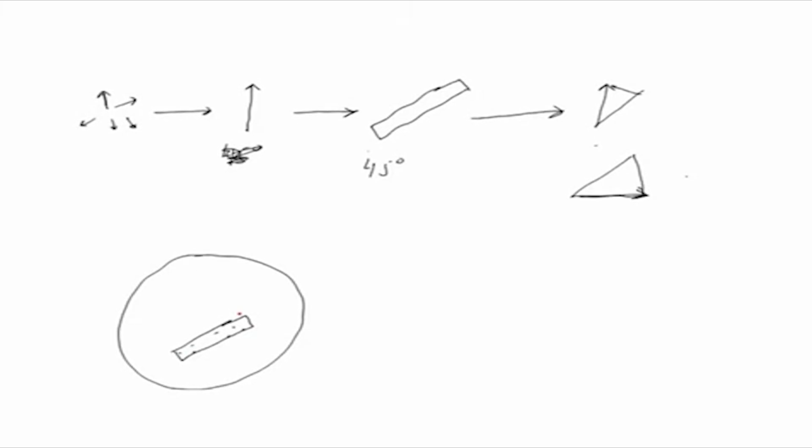Now, if I rotate it, why is a rotating stage required? As you rotate it, if it is in this direction or in this direction, they will not be seen, no image will be seen, because, like I said, they are either aligned to the polarizer or aligned to the analyzer, and light will not pass through.